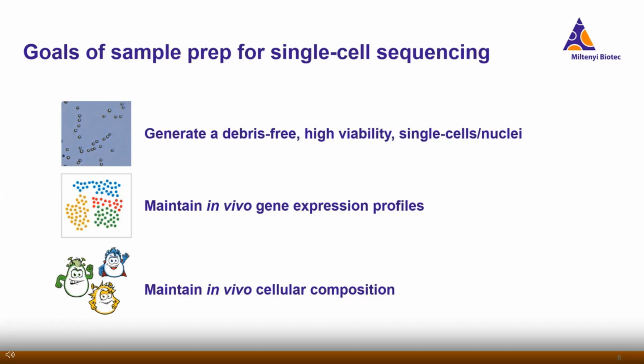So while tissue dissociation methods have been around for a long time, it's really only been in the last several years that there has been an invested interest and ability to understand and document the impacts of tissue dissociation on gene expression, which of course is the result of the rising popularity of single cell sequencing.